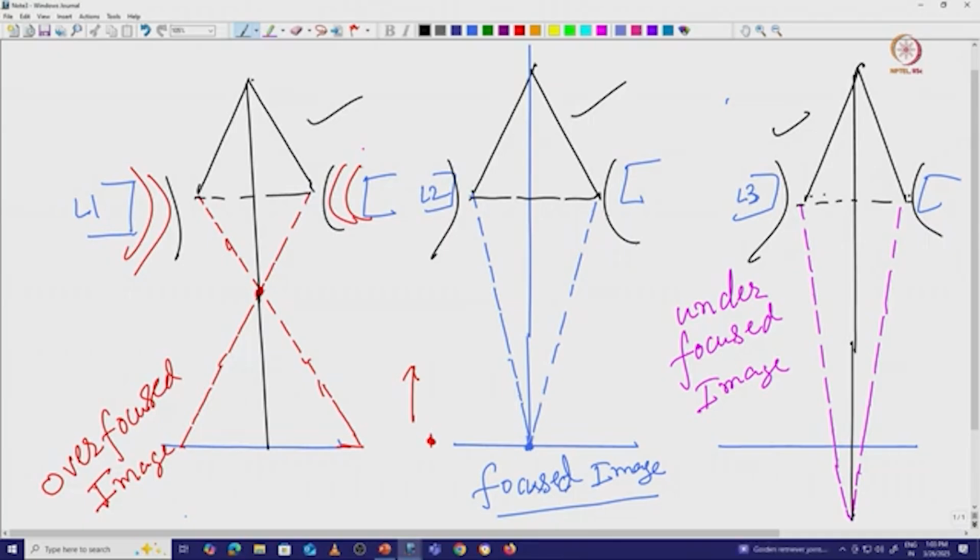And now if we just try to measure this angle, this is alpha 1, this is our lens system, that I mentioned, lens 1, lens 2, and this is basically our object, and this is basically our image.